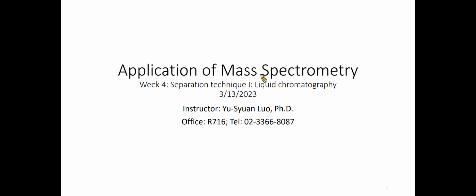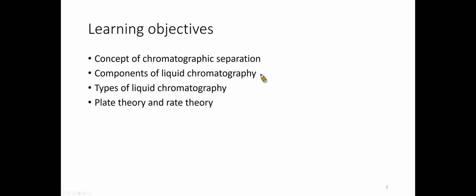In today's lecture, we will talk about the first separation technique, liquid chromatography. In this lesson, you will learn the concept of chromatography separation, the components of liquid chromatography, the types of liquid chromatography, and the plate theory and rate theories to understand liquid chromatography.